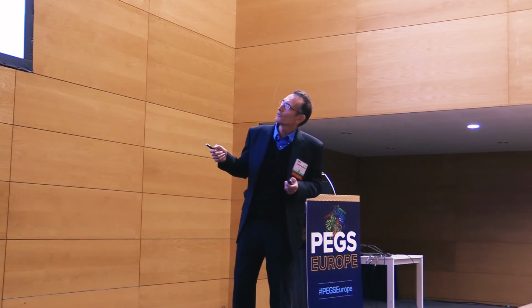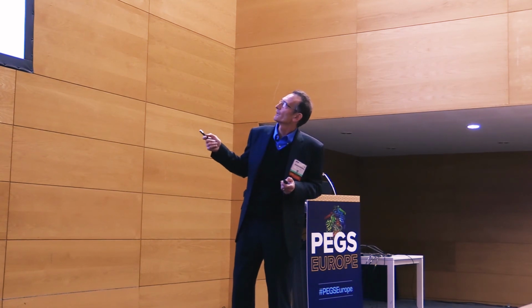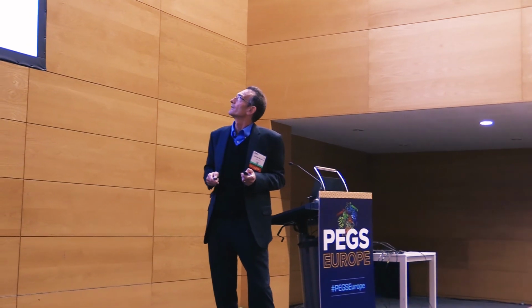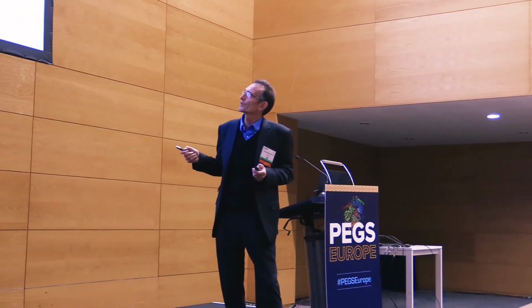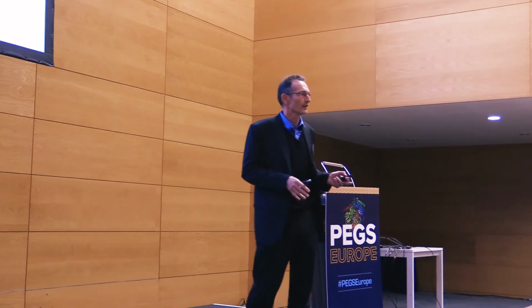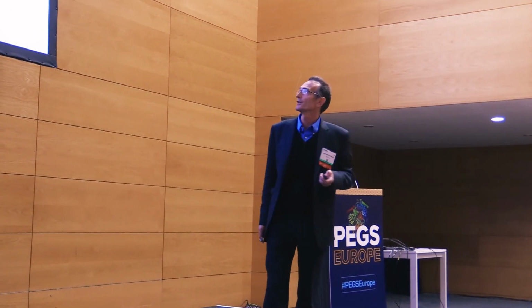Now, if you look at the clone, this particular clone here, which is in yellow and orange, essentially it overlaps with the parental antibody. And the same is true for other clones coming from this library. And we see similar patterns for the other four libraries with clones tested against them.